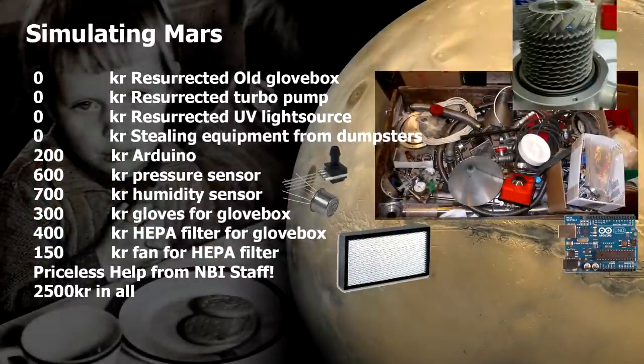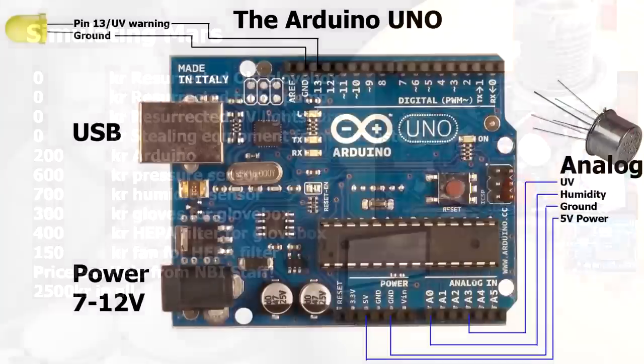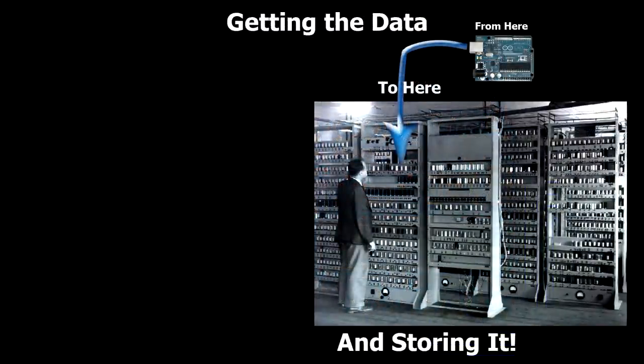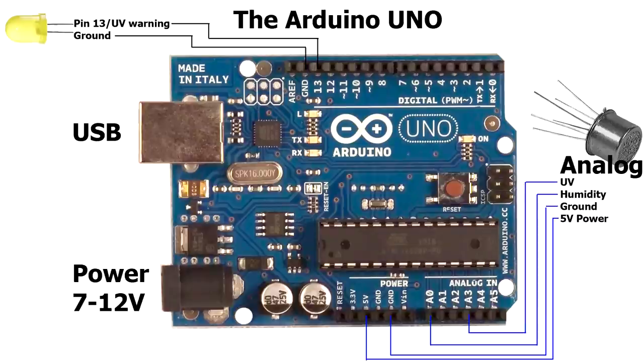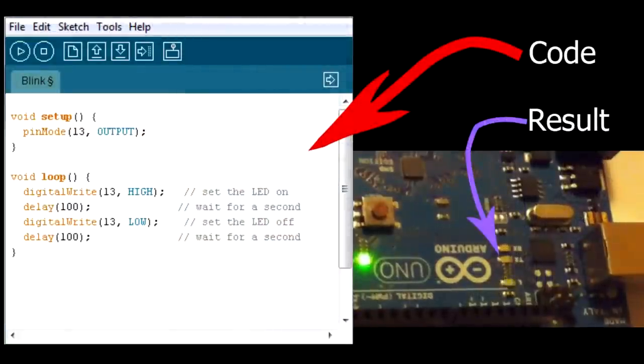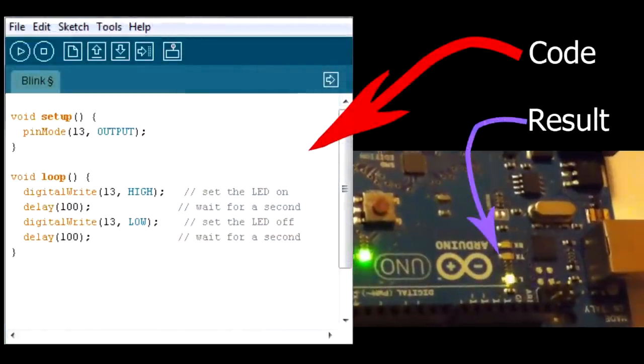So what I'm going to talk about here is how to program the Arduino for data acquisition and how to store this data on a computer. For those of you who don't know the Arduino, it's this incredible little open source $25 board, which is programmed in C and is incredibly easy to program.